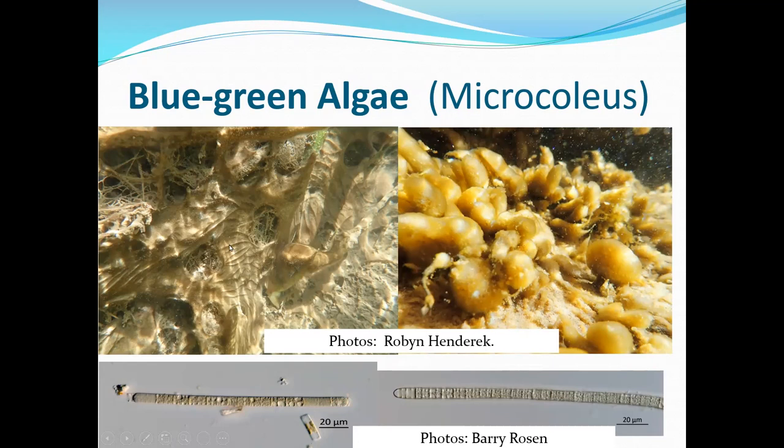This kind of crenulate folded look is very consistent with this particular Microcoleus species in this particular system. And it really does look like diatoms. The water is almost crystal clear, and it's on top of macrophytes, on top of substrate, on top of itself, and has a pretty consistent morphology. So you have to wonder when you're looking at this stuff. I'm definitely a lot more cautious now when I'm wading into water and looking at water.